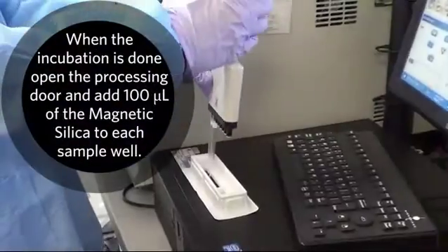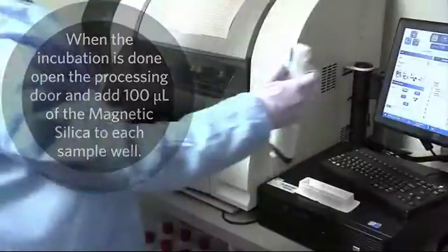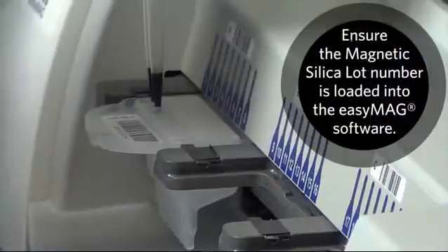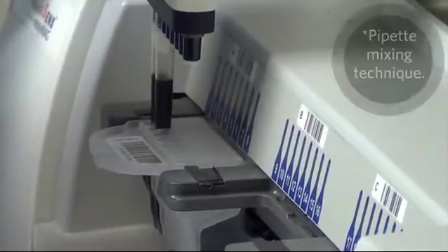When the incubation is done, open the processing door and add 100 microliters of the magnetic silica to each sample well. Select the bead icon and scan the magnetic silica lot number into the EasyMag software and assign it to each sample.